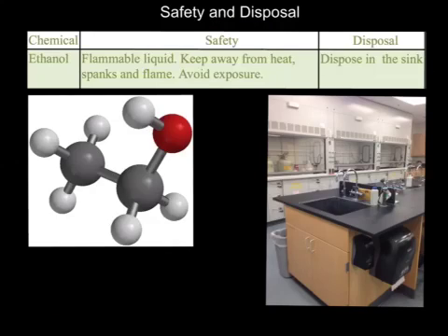Ethanol is a very flammable liquid and should be handled with care and should be kept away from heat and open flames. It should not be ingested and can cause irritation to the skin, eyes, and the respiratory tract.